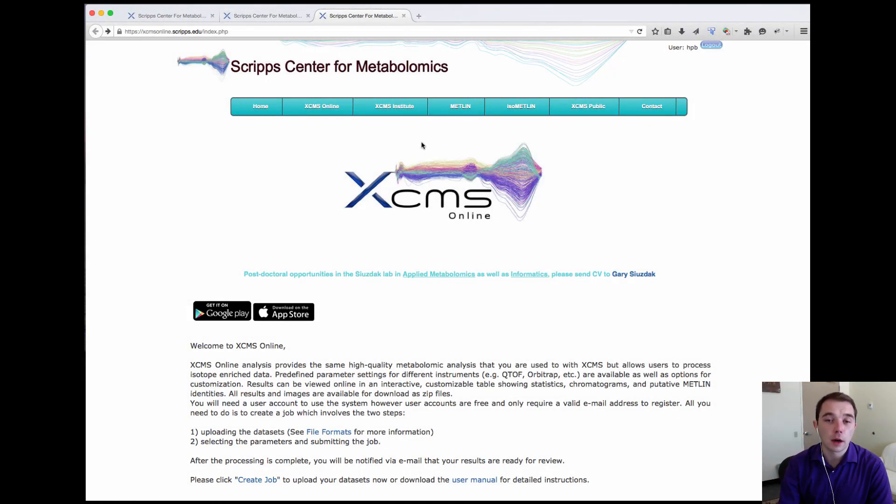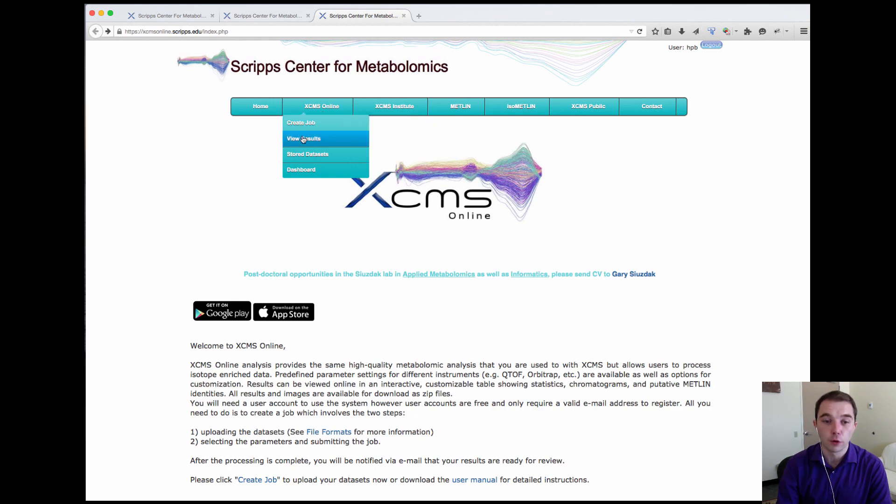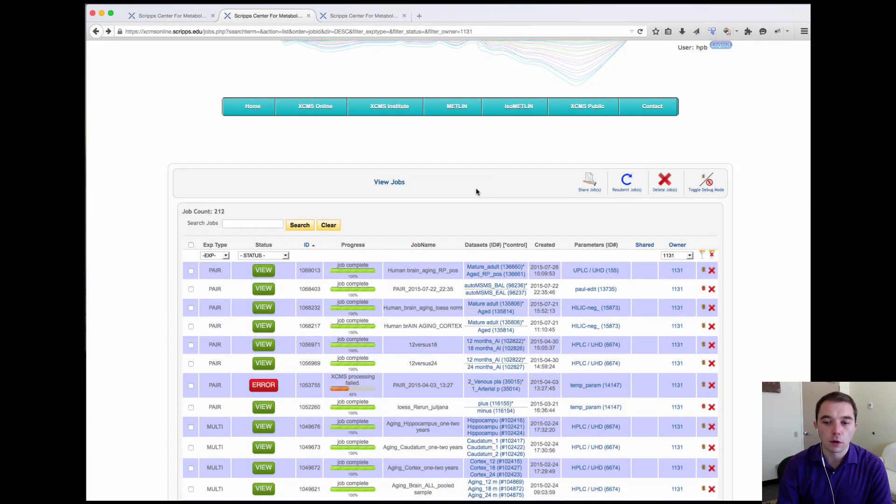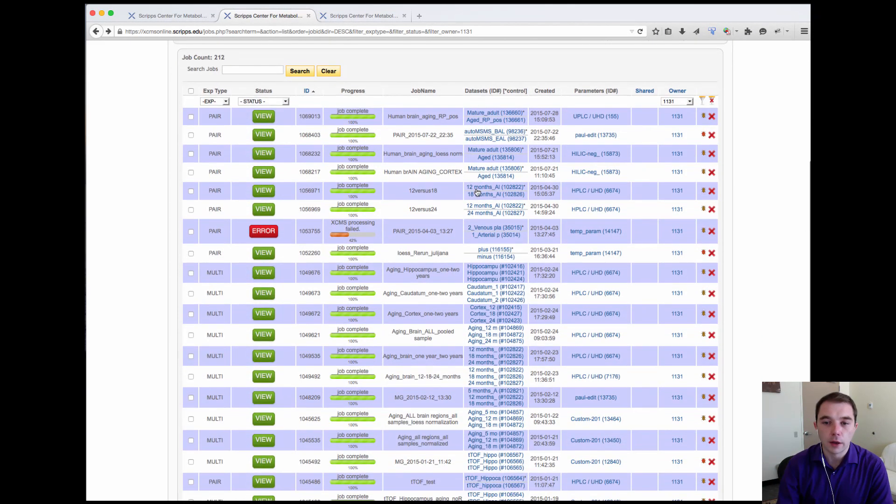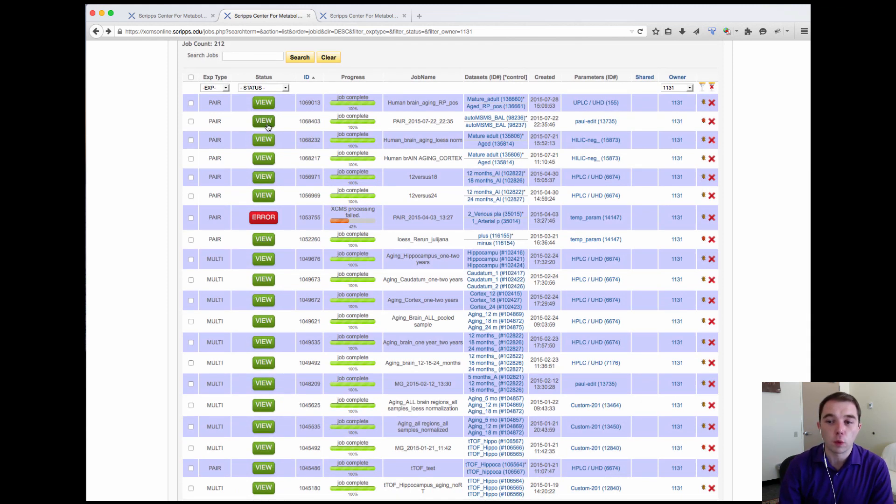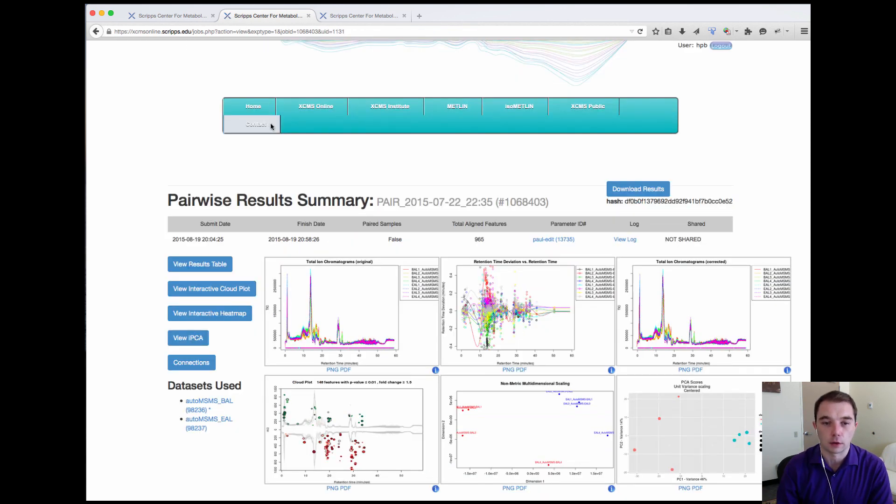You can see that I'm already at the start page and from here to view my results I can simply go to the XCMS Online view results tab. From here I can see all of the different results and I can view this one result that I ran with some MSMS data in it.